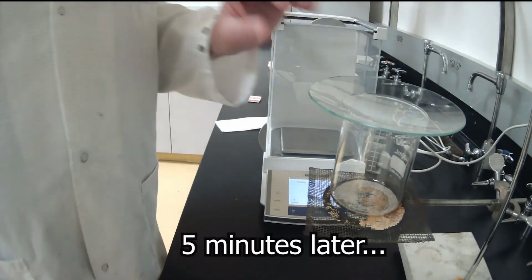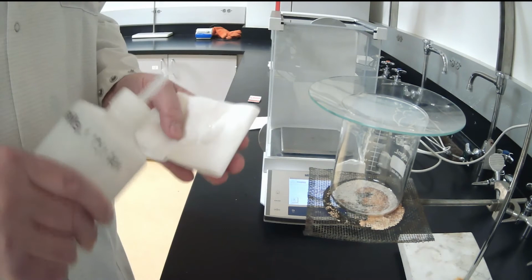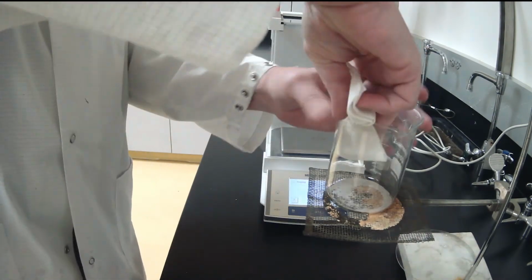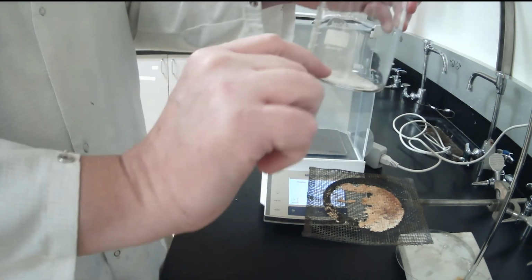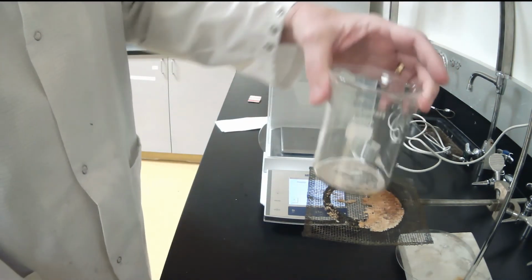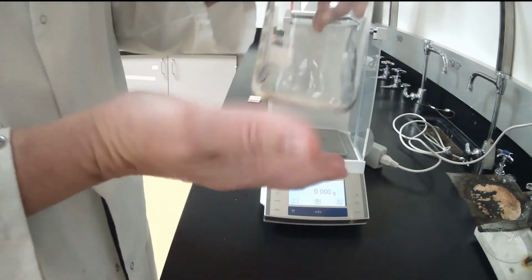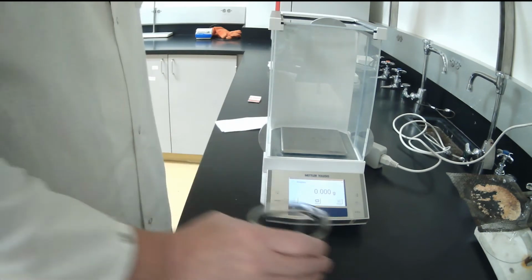Alright, we have now waited the 5 minutes of cooling. We are ready for our final wipe down of the ammonium chloride. Again, we're going to use a damp paper towel. And again, it's important to not touch the bottom. That's why we had the 1-inch gap of clear glass. It looks like now our beaker is ready to be weighed. That is the next step of our experiment, to make sure this is cool enough that it won't change weight when we put it on the scale.